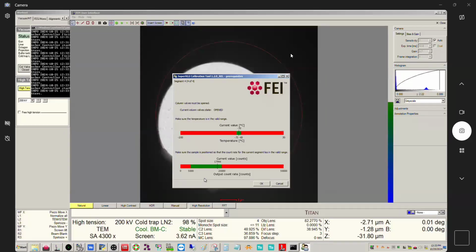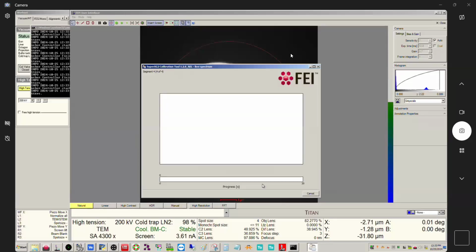And that's good. Can give it a little bit more juice here. Okay. And there we go. Yeah, so pretty quick to do. It's only 30 seconds a segment.